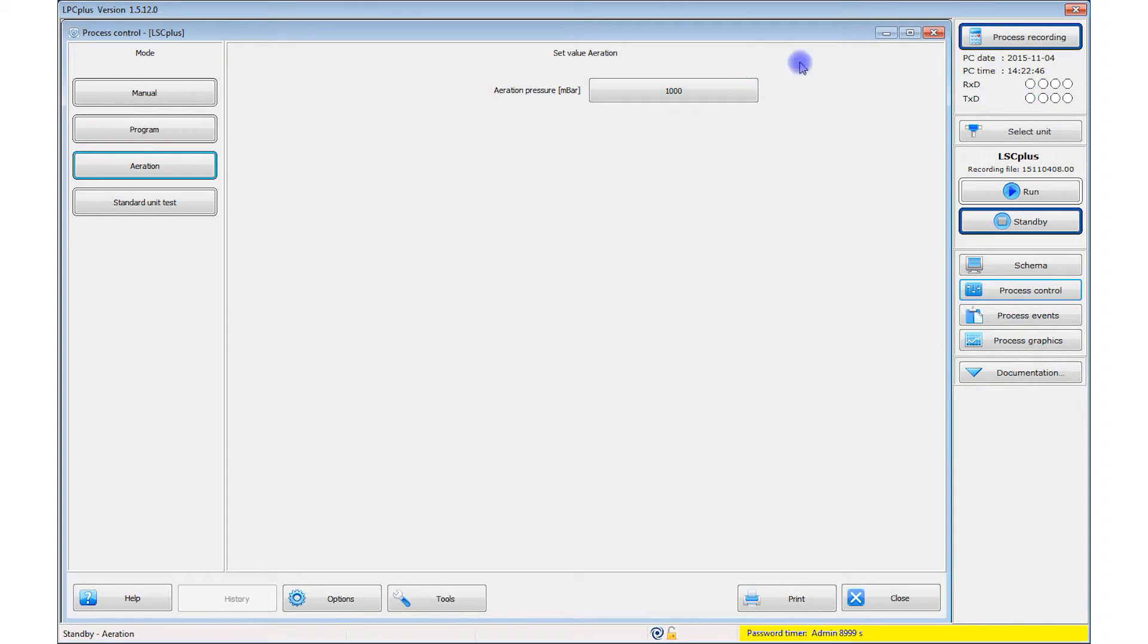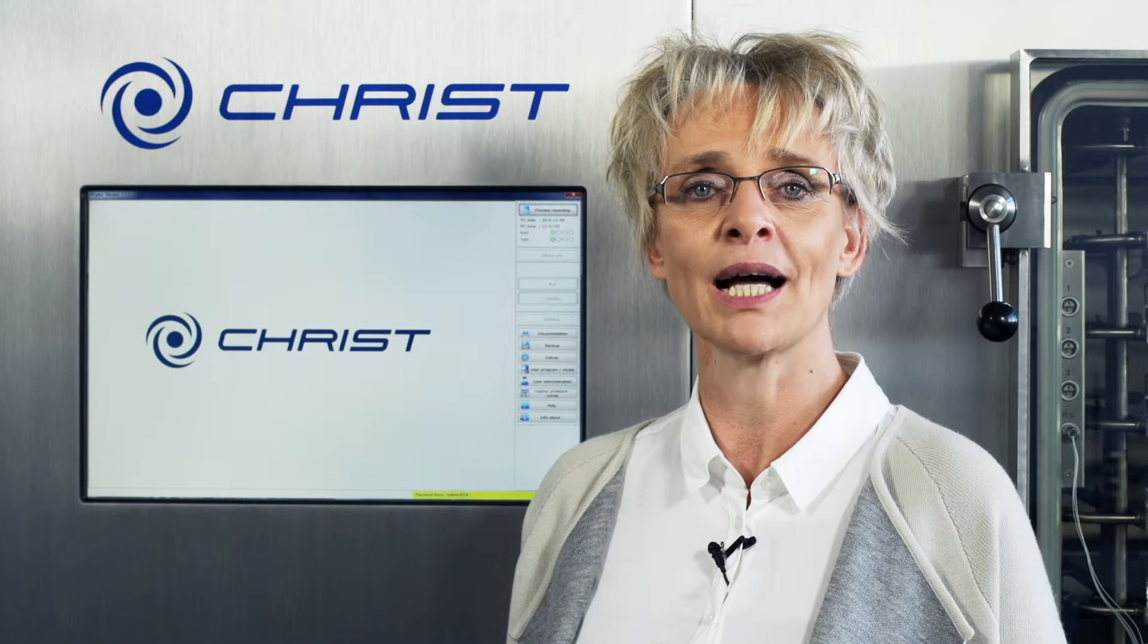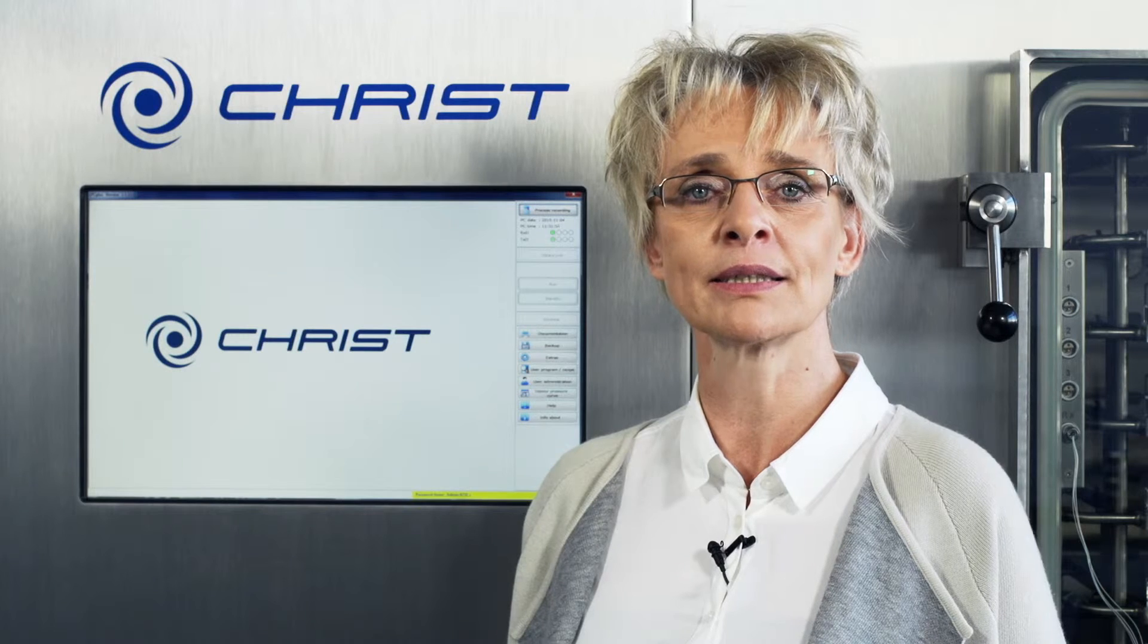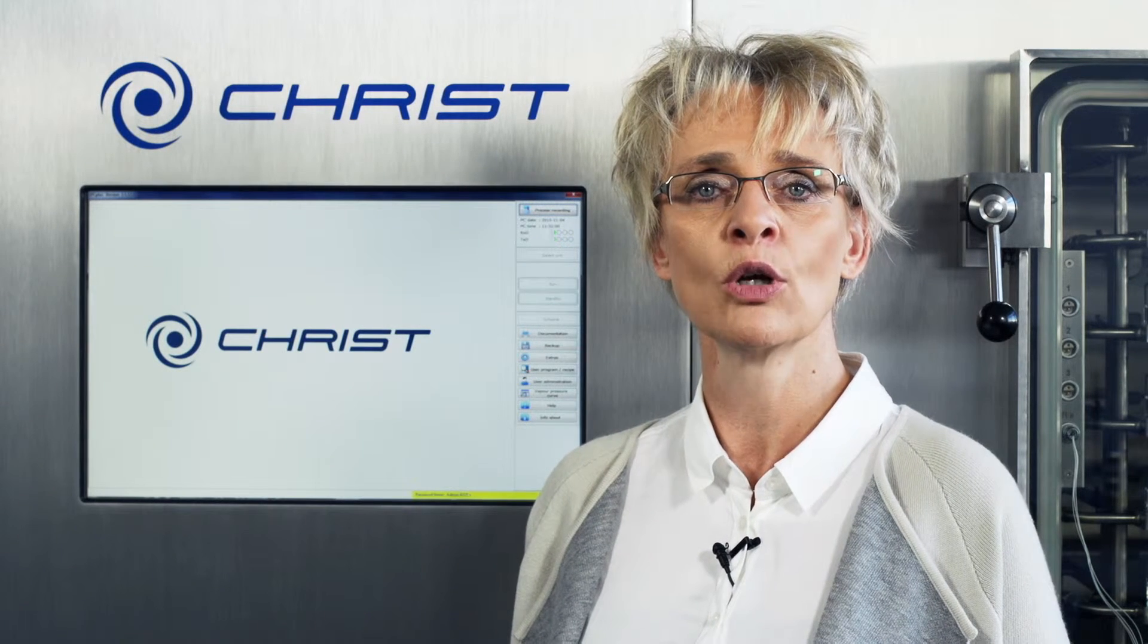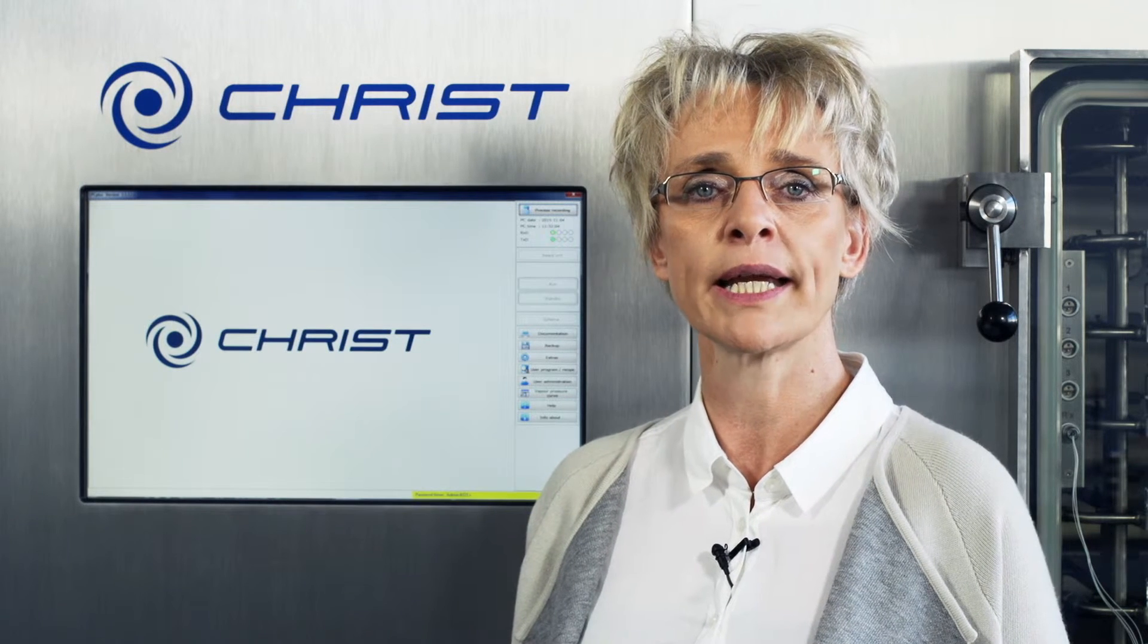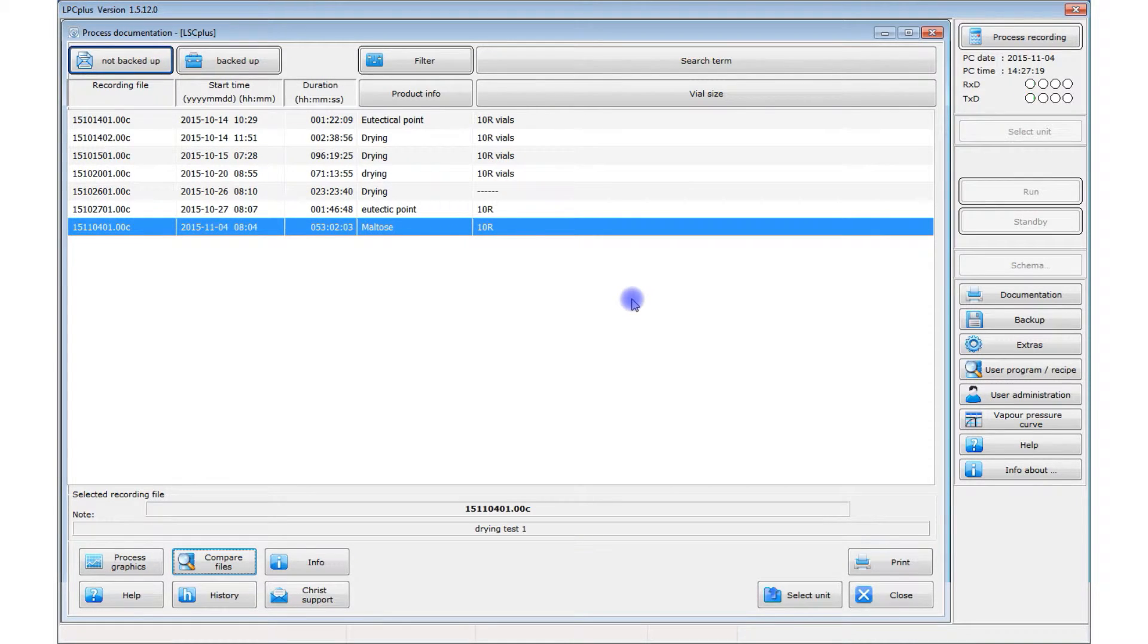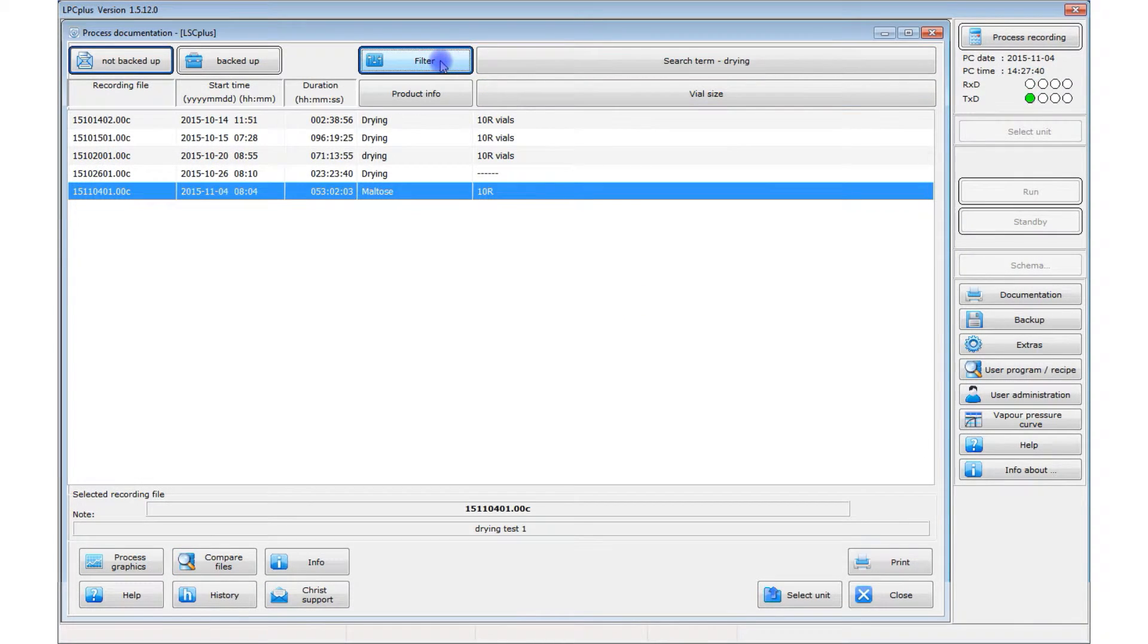You also have to stop process recording. All the processes you have recorded are shown under documentation. All data is stored in the integrated database, in compliance with the relevant GMP and FDA guidelines, and is available whenever needed for process documentation. The documentation window shows a list of all process records.